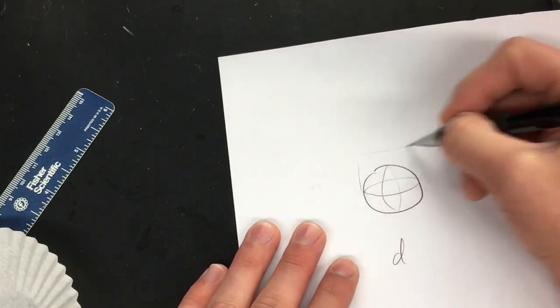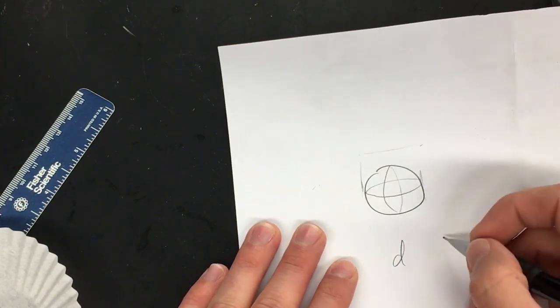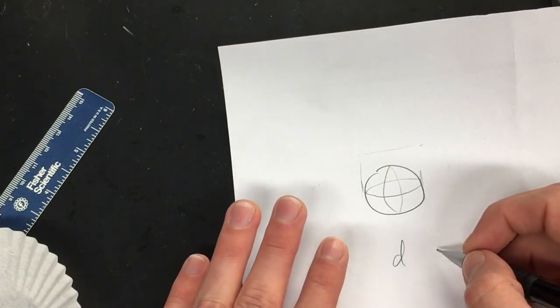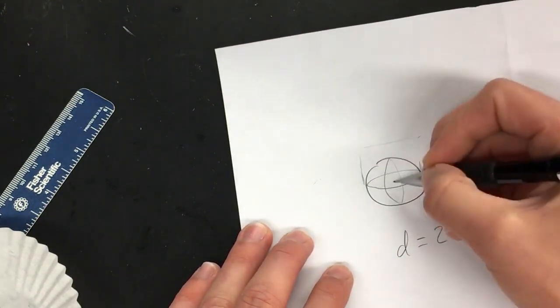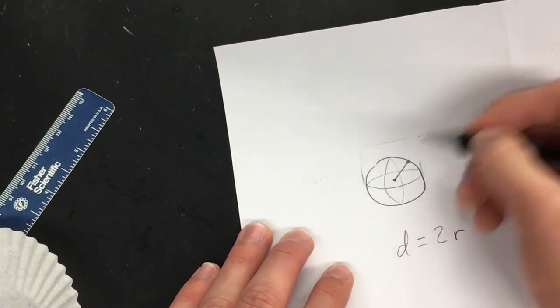That means I took whatever this length was from one end of the sphere to the other. Typically, when we do measurements with spheres and we're measuring volumes and areas, diameter is equal to 2 radii. Well, a radius is just from the center of the sphere to the outer edge.